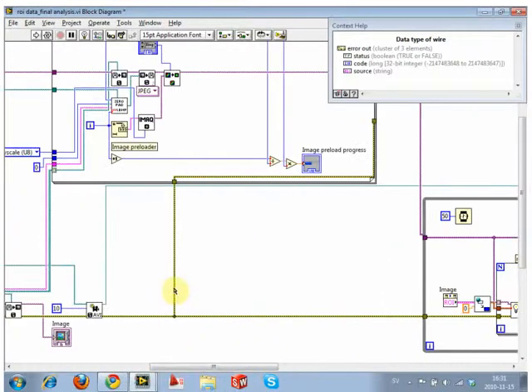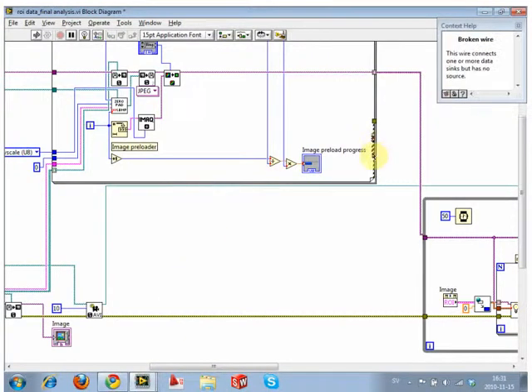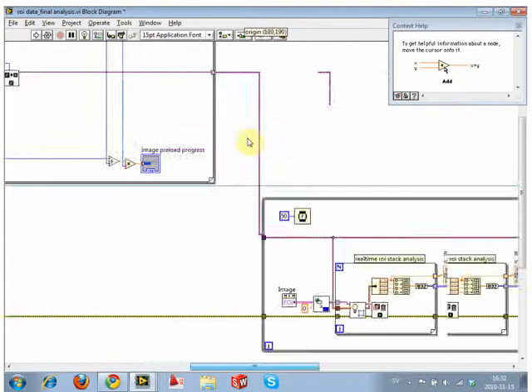But yeah, I use error lines quite a lot just because it gives a little bit of an easier flow direction. You can have wacky stuff all over, running up and down and left and right, but at the end of the day, if you know which is wired together as the critical sequence, you know where it's going.